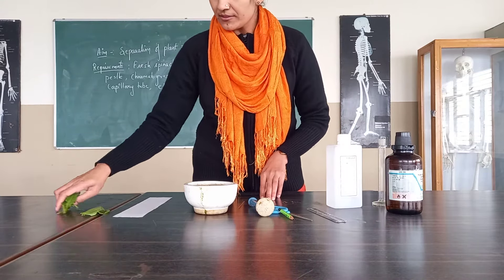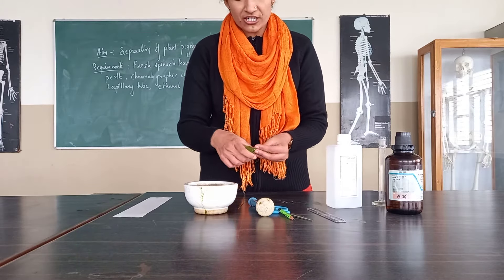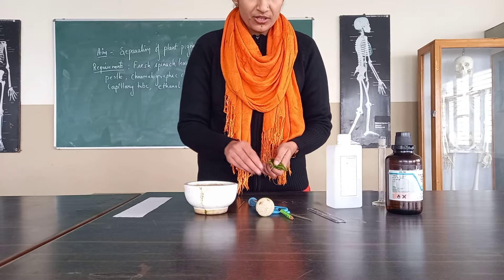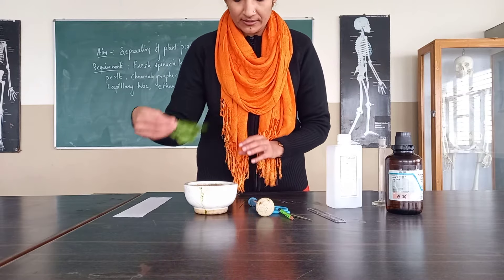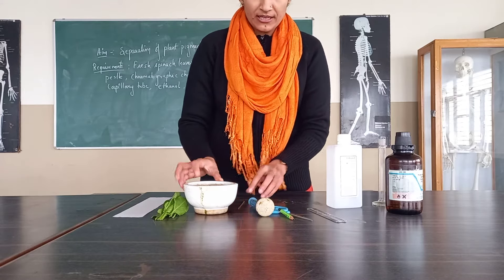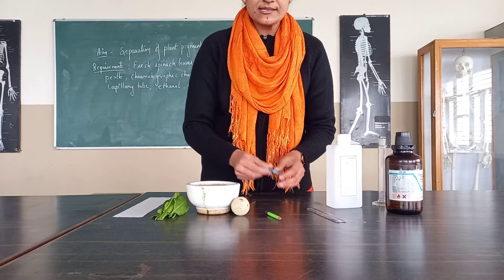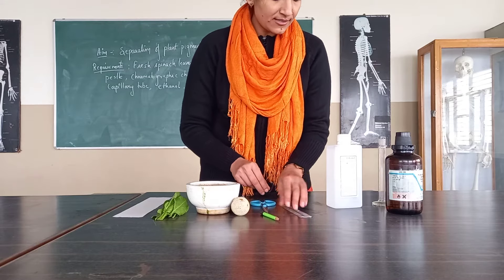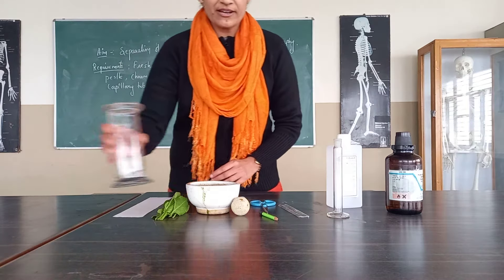We need the plant part. We are using the fresh leaves of spinach. We will further chop, grind, and extract. We need the pestle and mortar to grind this. We need scissors, we need a scale, we need a measuring cylinder, and we need the chromatography jar.